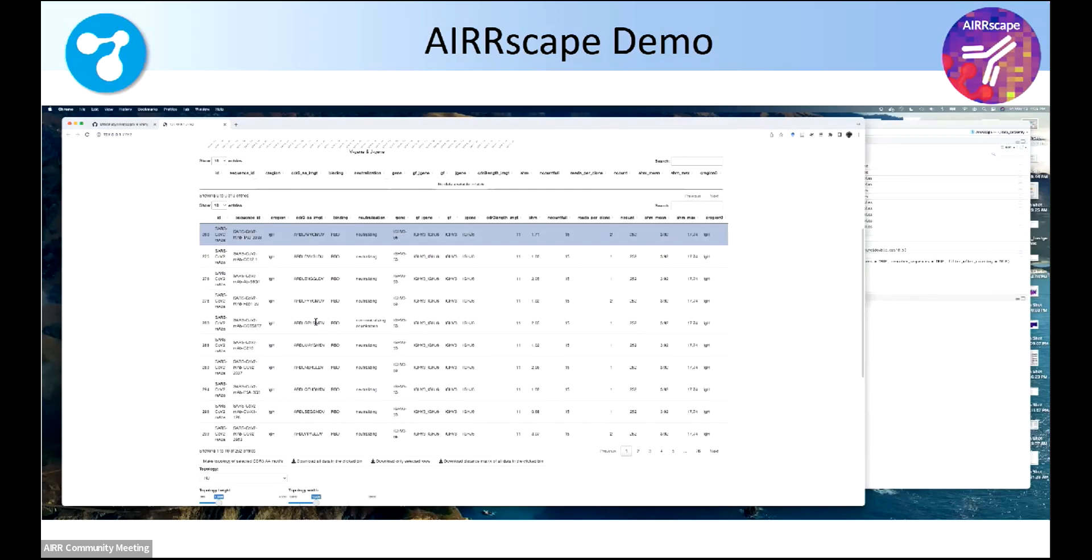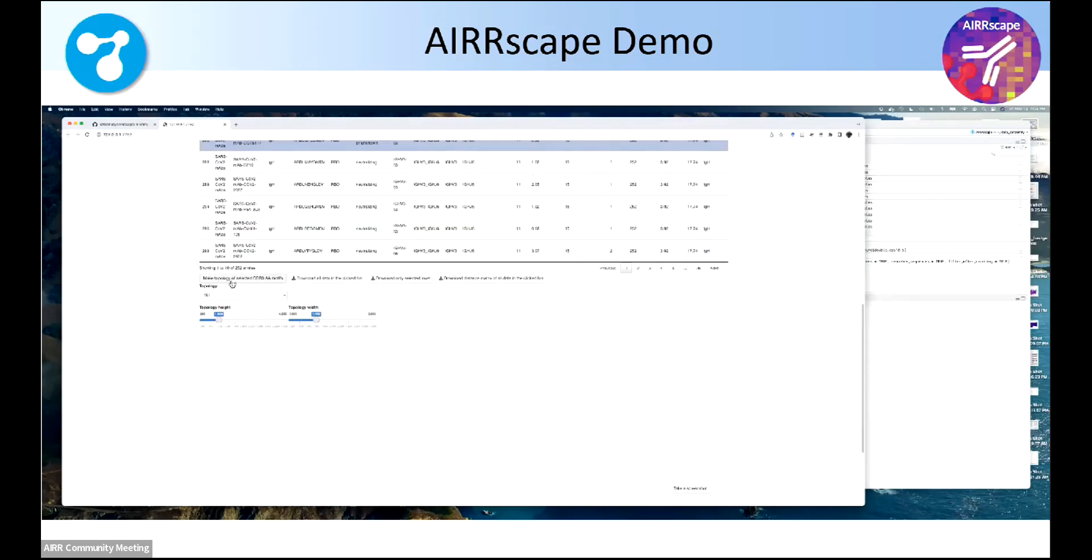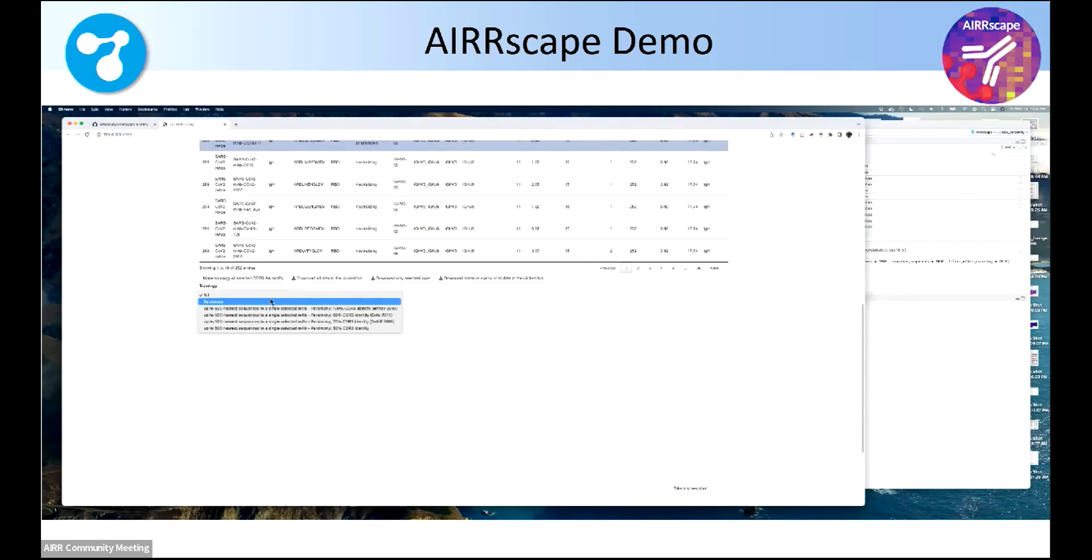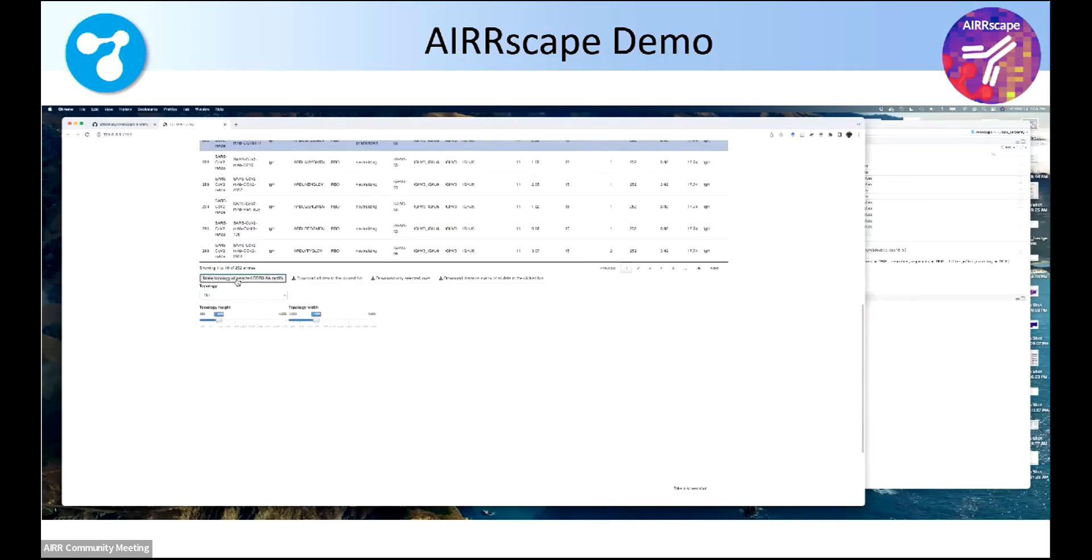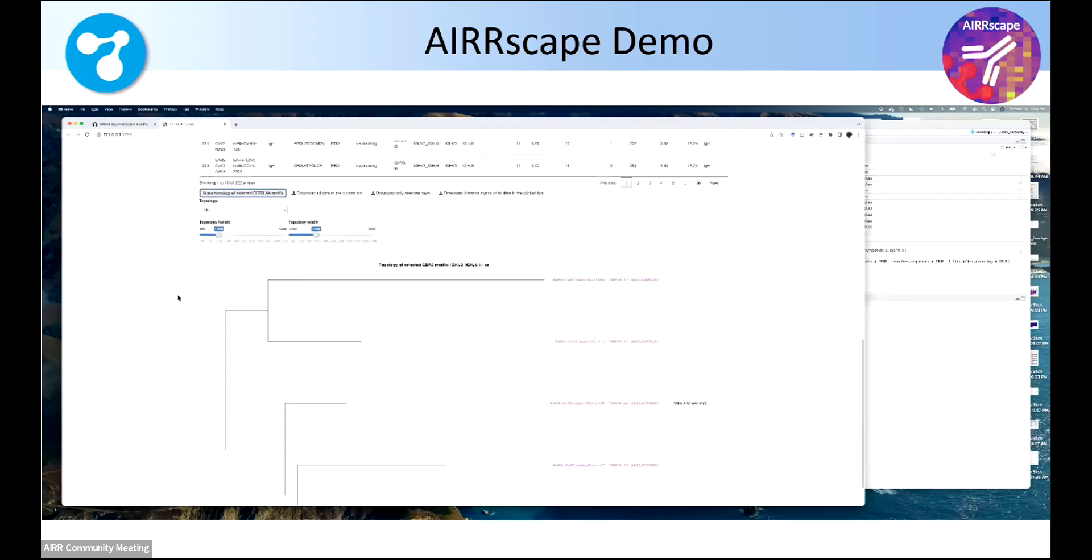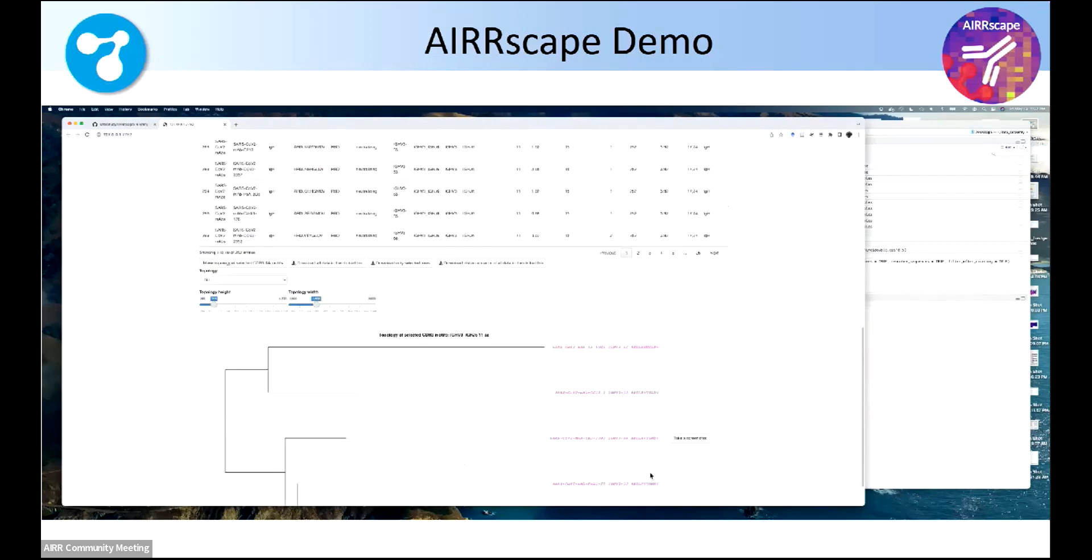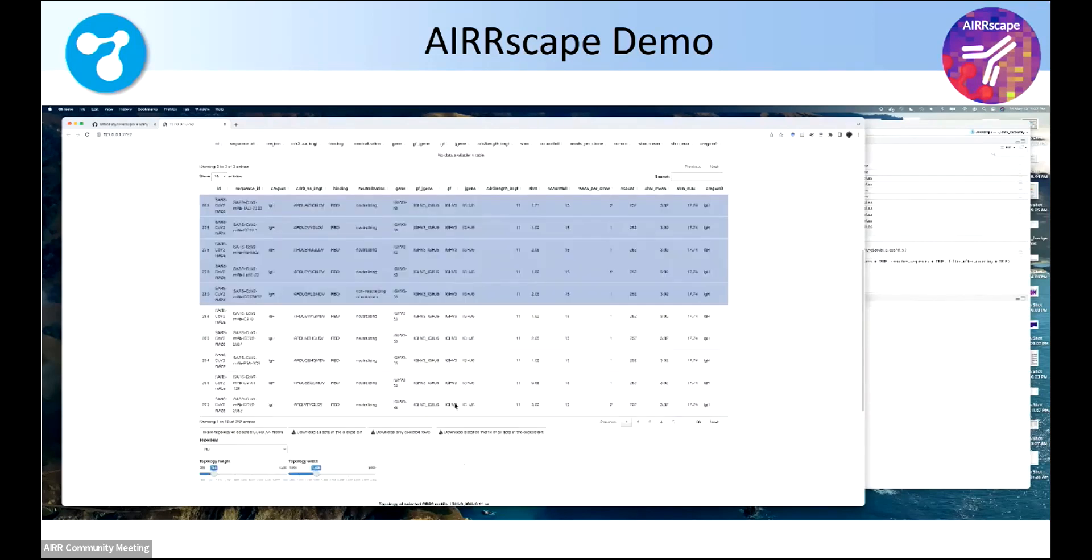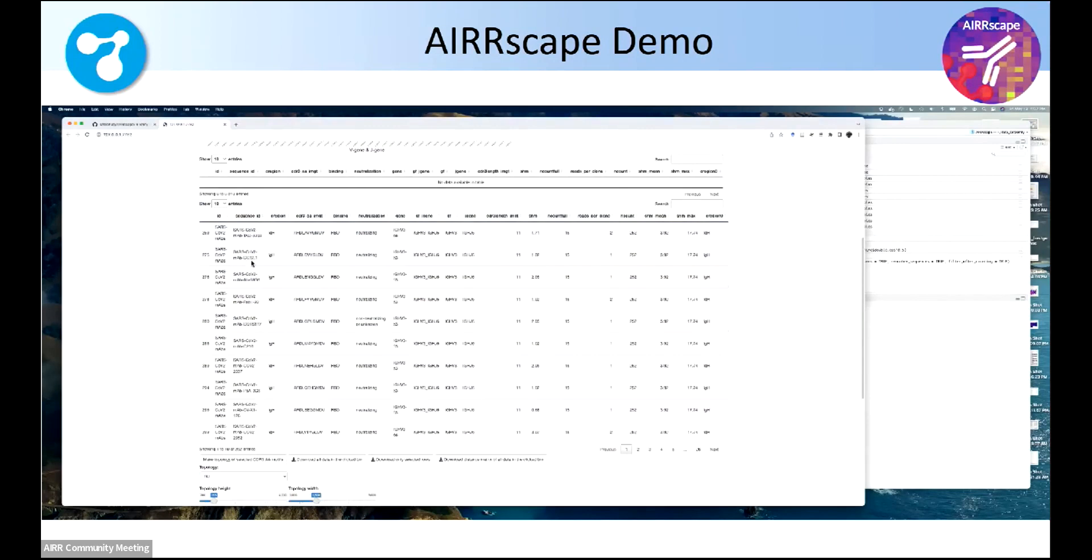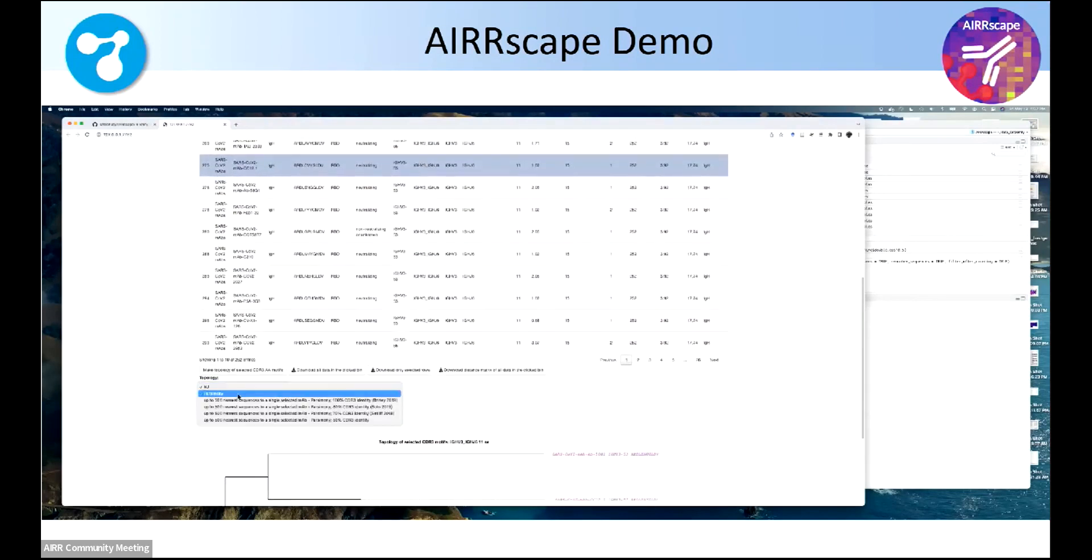Now here's what I think is the cool part. So let's just take, I just randomly picked five. Now they have the same CDR3 amino acid sequence length, right? So this is on the fly, creating a little topology, not really an alignment because it might not be related to see how these amino acid sequences compare to each other. And then the coolest part, I think, is you can pick a single antibody sequence you're interested in, CC12.1, for example.